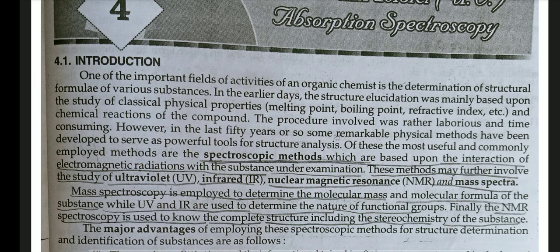The procedure involved was rather laborious and time consuming. However, in the last 50 years or so, some remarkable physical methods have been developed to serve as powerful tools for structure analysis. Of these, the most useful and commonly employed methods are the spectroscopic methods, which are based upon the interaction of electromagnetic radiations with the substance under examination. These methods may further involve the study of UV, infrared, nuclear magnetic resonance, and mass spectra.